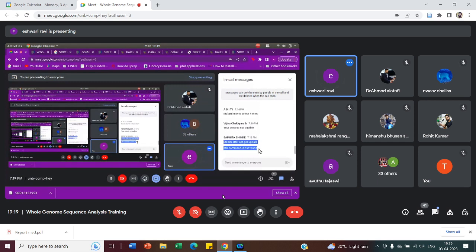You will have to install the wget command in your system.